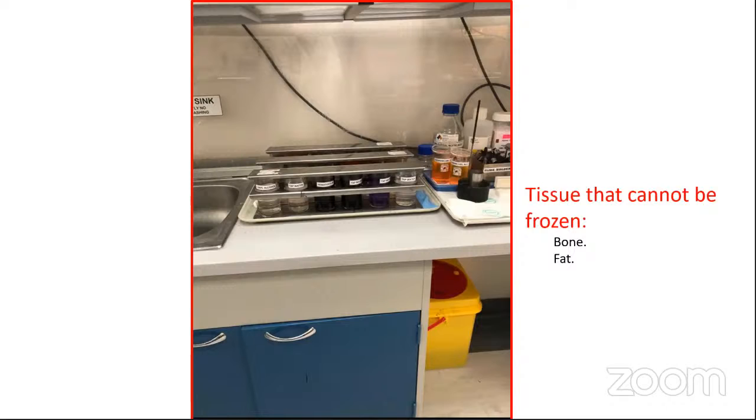I just want to mention that tissues that cannot be frozen are bone and fat. Bone needs decalcification. It cannot be cut by a regular knife. It has to be decalcified for 1 or 2 days before processing. The other tissue that cannot be done by frozen section is fat, because it is very soft and friable. It's almost impossible to cut a tissue that's only fat.